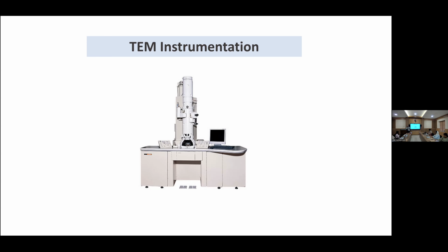Crystal defects we can see there, but this kind of vacancies, I'm not sure. Is it at the atomic level? Then it's possible. Because our advanced electron microscopes can show up to hydrogen atom vacancies. That much, because that's the smallest atom. Those electron microscopes are capable of showing a hydrogen atom. And if there is some hydrogen atom missing, that also we can see there.